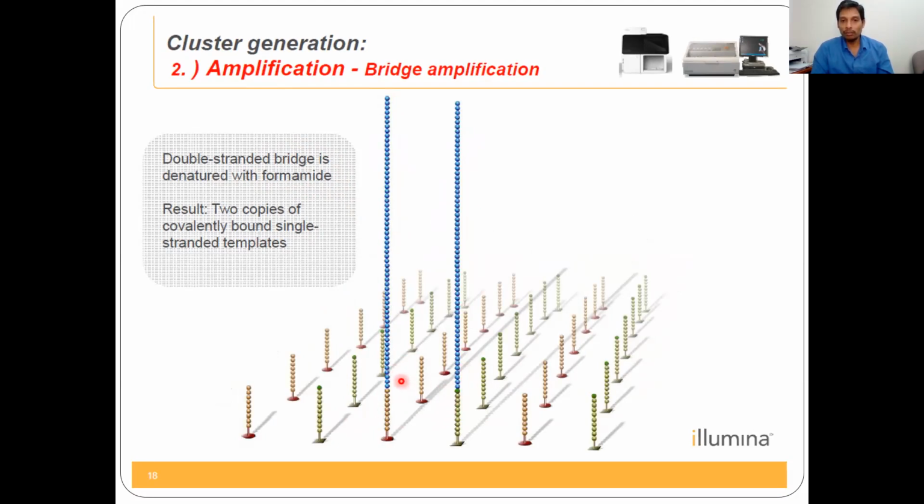Are the two the same? Actually not the same. Sequence-wise, you can see an entire difference, because this one is complementary to the original and this one is similar to the original sequence, newly synthesized. And these two are complementary to each other. Of course, in genomic DNA, both are linked and complementary to each other, but sequence-wise entirely different, right? Except the adapters, which are complementary to the primers.